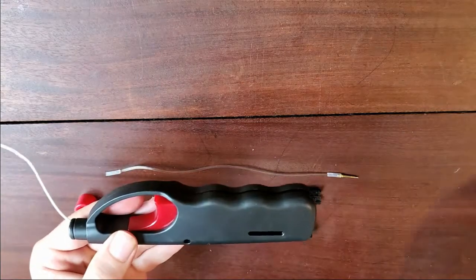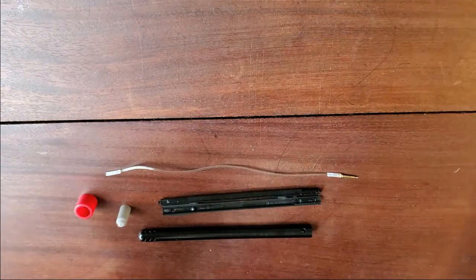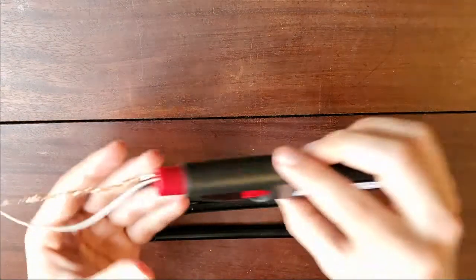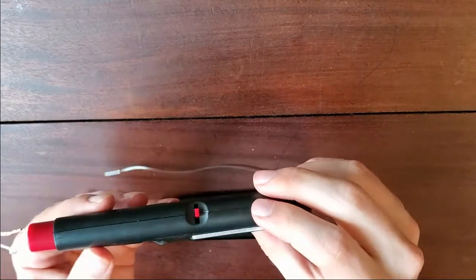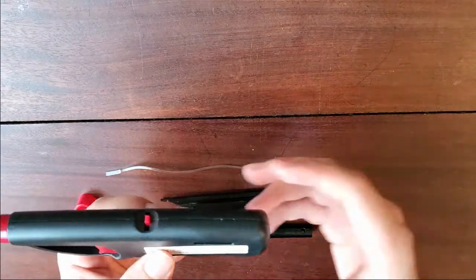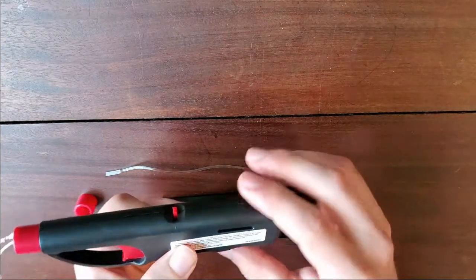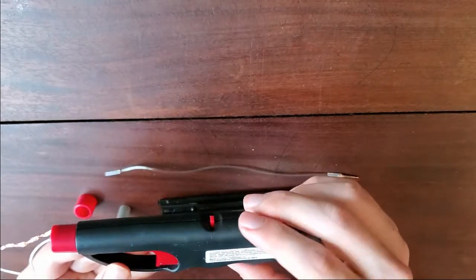And there it is. I'll do a jump cut to one that I added an extra long lead to so that it works better — so that's this one. That's the electropen. And unlike the iGEM project, you don't need to do any fancy 3D printing of the case or anything — you can just use it almost out of the box, which is nice.